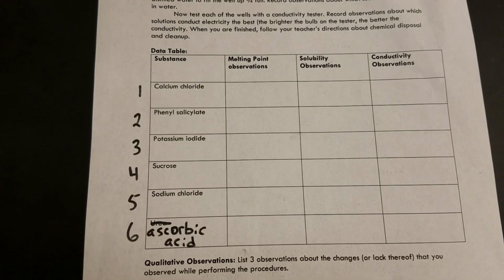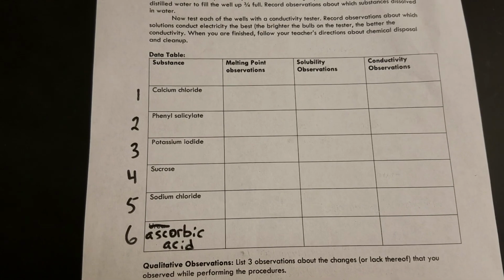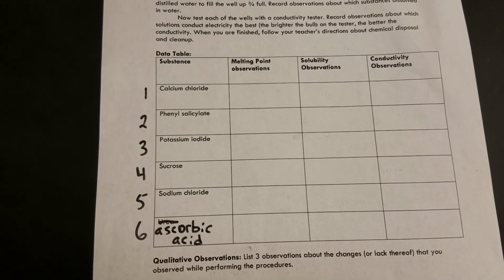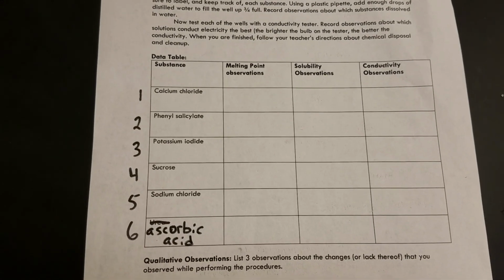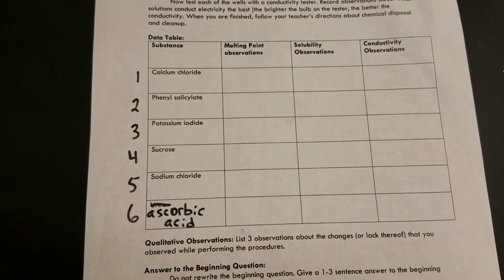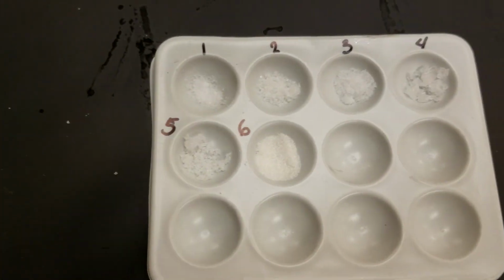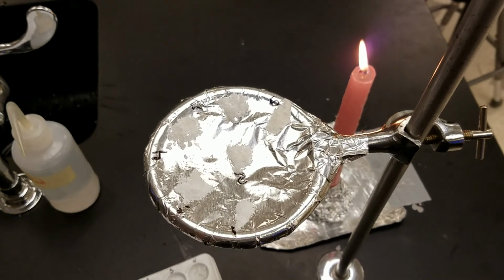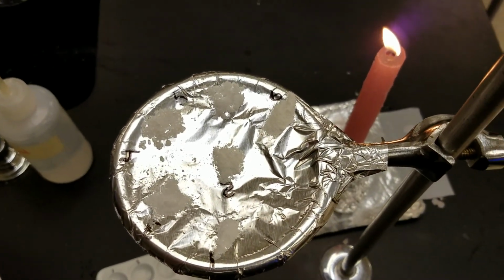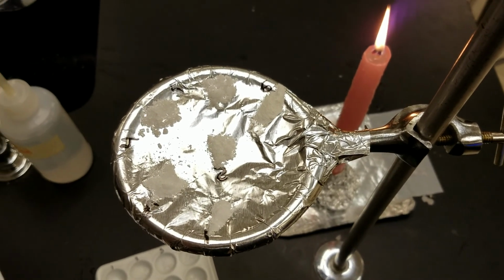Now we are going to be testing the melting point, the solubility, and the conductivity of all of these. Some of them will melt, some of them will dissolve, and some of them will conduct electricity, but not every single one of them. I have them labeled 1, 2, 3, 4, 5, and 6, so I can better keep track of them. I have 1 through 6 labeled on my solubility tray, my well plate, and on this aluminum foil platform where we're going to be melting each separate chemical.